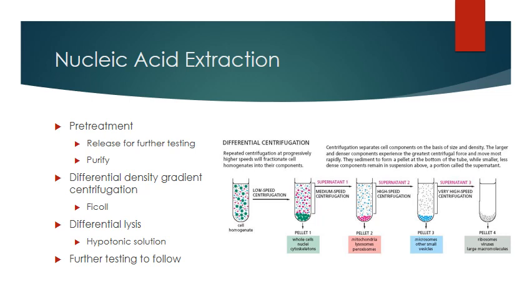In hematology, you learned that red blood cells and white blood cells don't have the same kind of osmotic fragility when you test them. Red cells are very easy to lyse. A little bit of water, bang, they burst. White cells will last a little bit longer. So, well, water will lyse white cells, so don't use that. But if you use certain osmotic tensions in your fluids, you could lyse the red blood cells much easier and quicker than you would lyse any white cells that are in there. Okay.